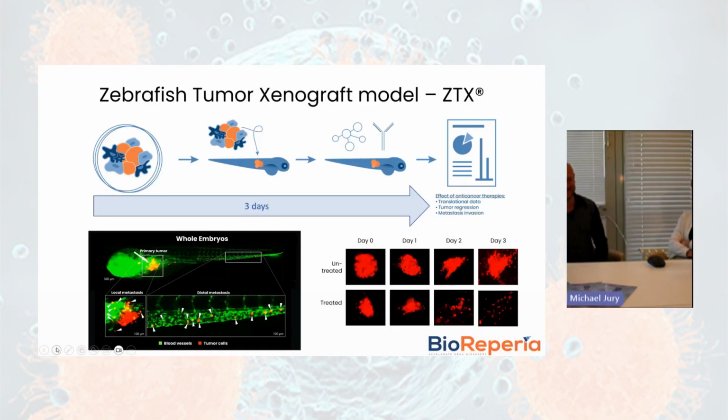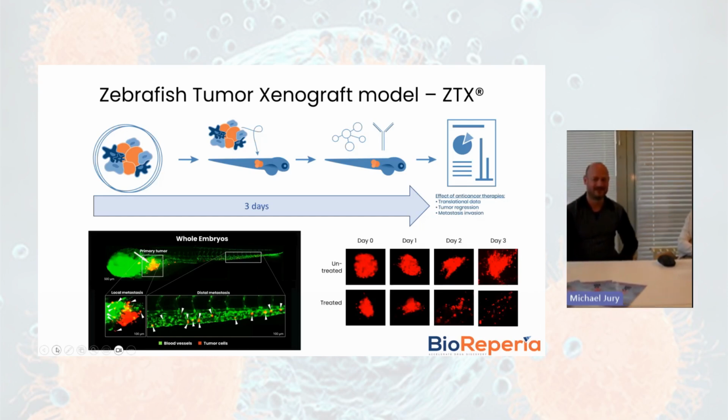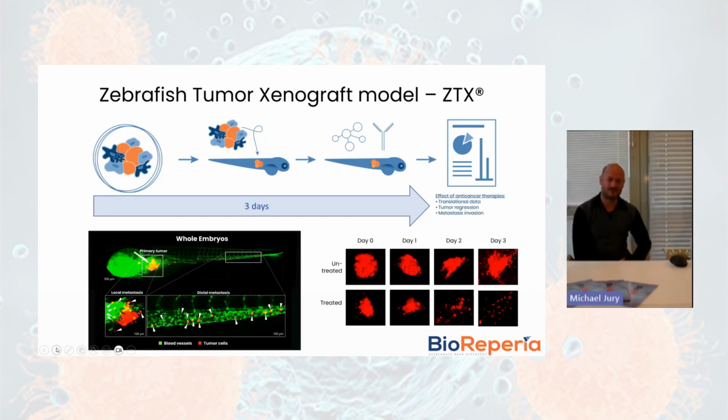Fascinating data, Linda. Really amazing studies. I will follow up on this with a bit of insights into how the zebrafish as a model system can be used also for studying EV aspects of cancer biology. So first, a general slide on the zebrafish tumor model. What the model consists of is that you implant tumor cells under the skin in zebrafish larvae that are 2 days old, and then you follow them for 3 days to see how the tumor grows and metastasizes.